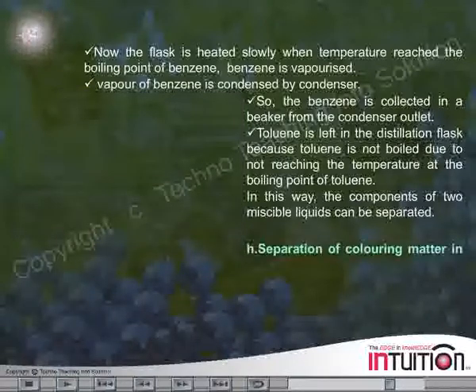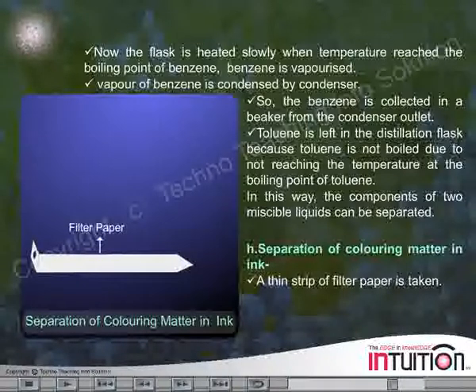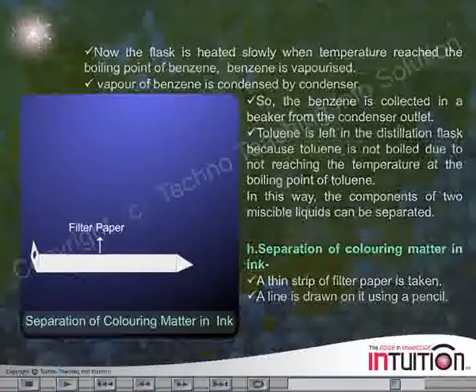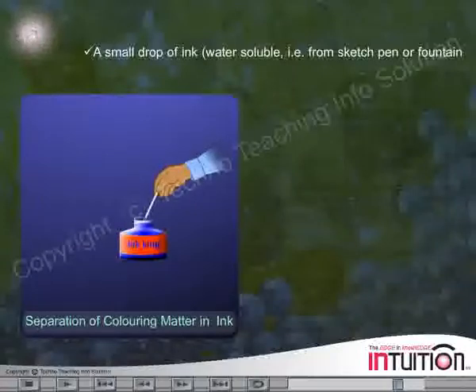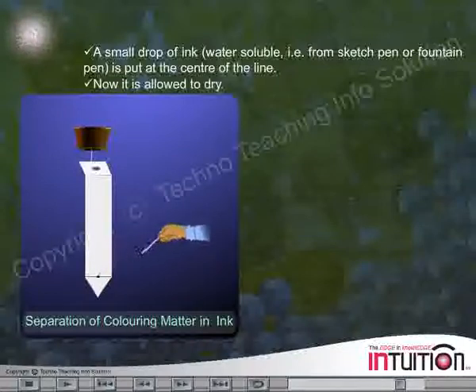Separation of coloring matter in ink. A thin strip of filter paper is taken. A line is drawn on it using a pencil. A small drop of ink, or water soluble ink that is from sketch pen or fountain pen, is put at the center of the line. Now it is allowed to dry.